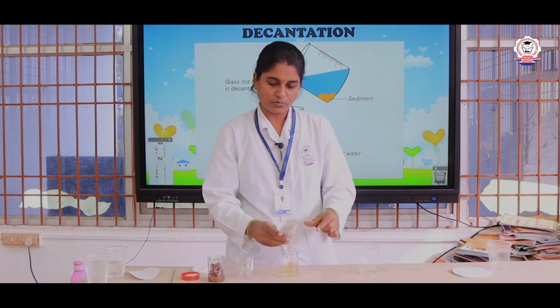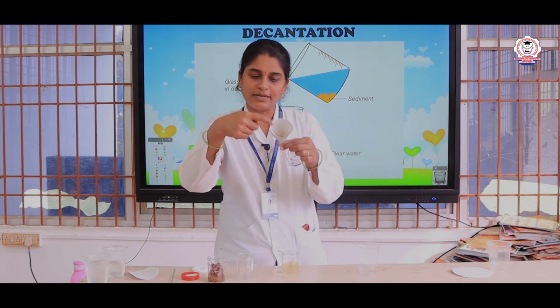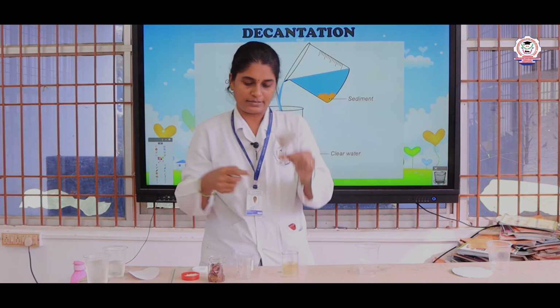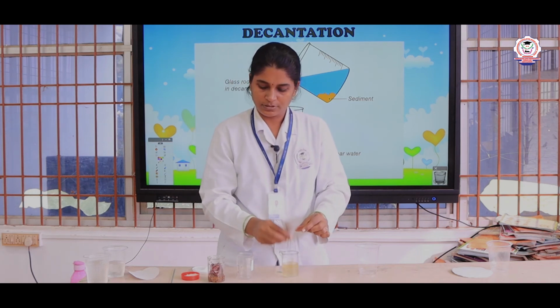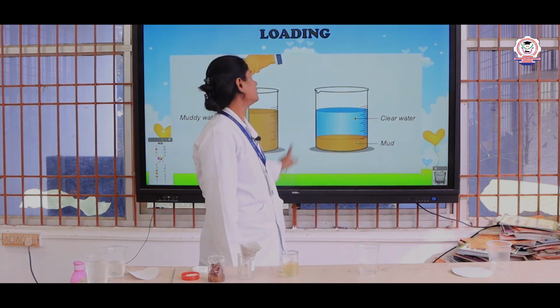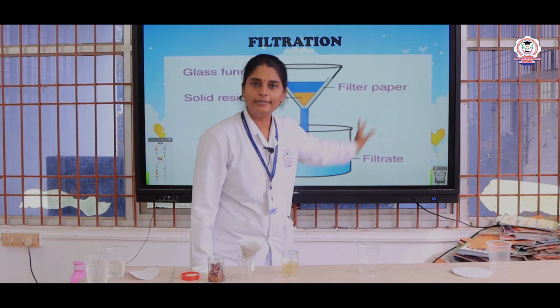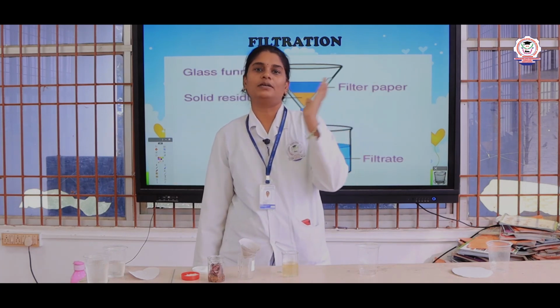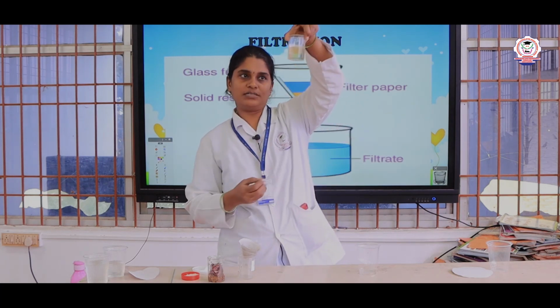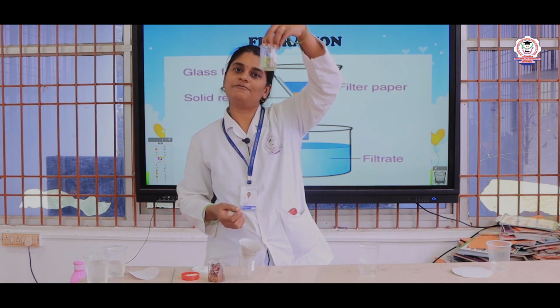You can see now the impurities are present inside the filter paper. Can you see? Yes. This process is known as filtration. After decantation, I can easily filter the pure water from the impure water. Now you see the water is very clear. This process is known as filtration.